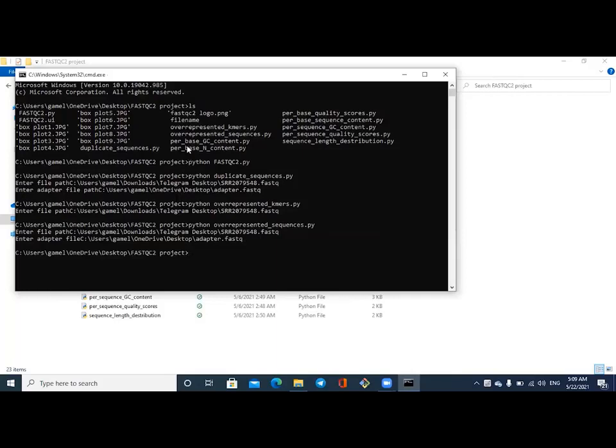Then I will execute the per-base GC content.